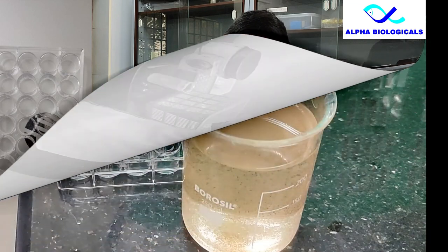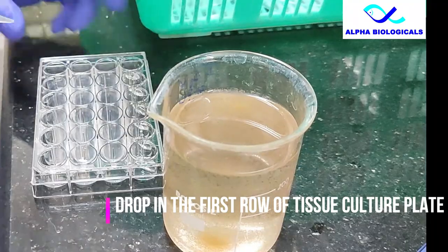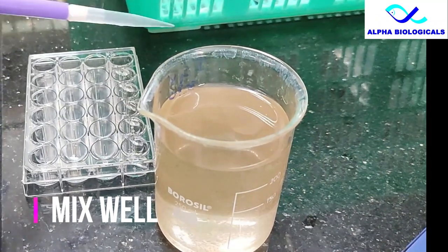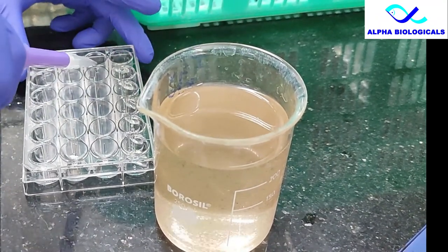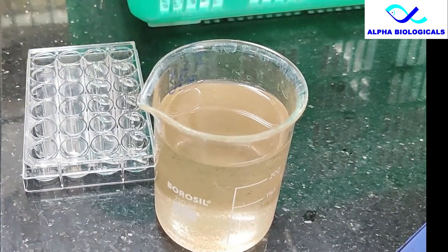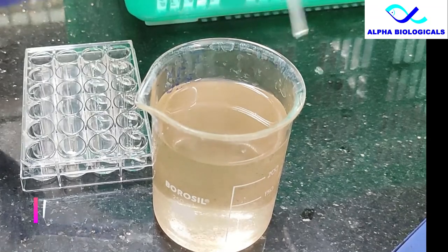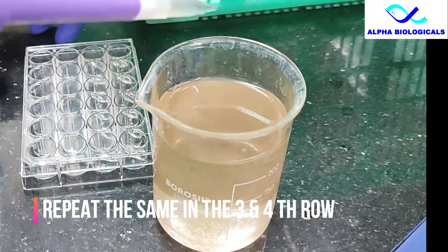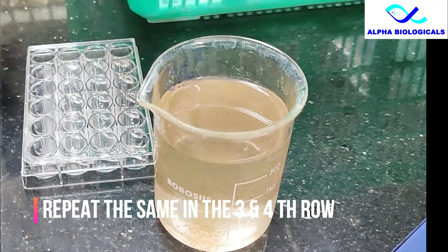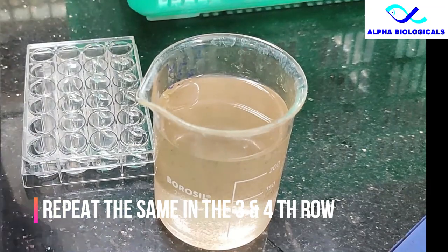Add 1 ml in the first row of the tissue culture plate. Mix well again, collect 1 ml sample and add to the second row. Mix well again, collect 1 ml sample and add to the third row. Mix well once again, collect 1 ml and place it in the fourth row.